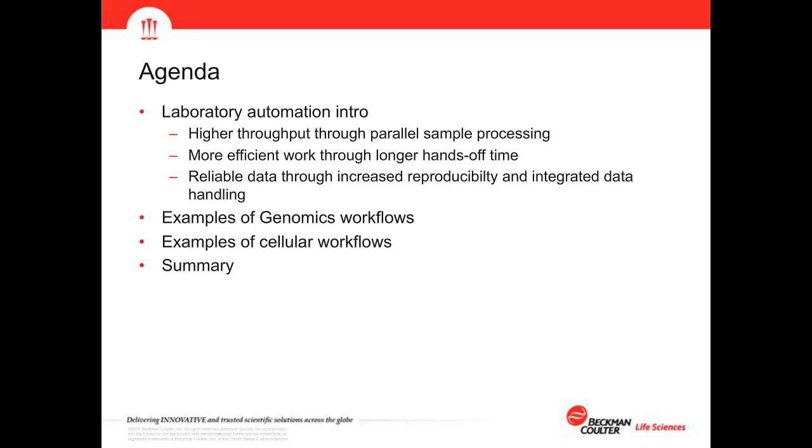After this introduction, I want to give you a couple of examples from two fields of application, one from the genomics workflows and one from cellular workflows. And in the end, after the summary, we have some time for a Q&A session, and I'm looking forward to your questions on laboratory automation.